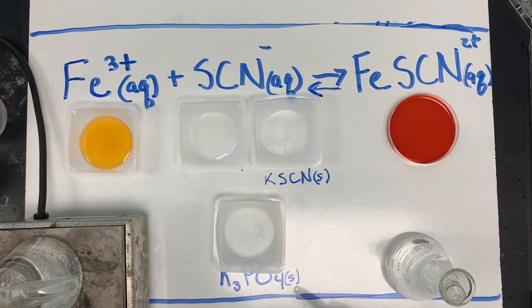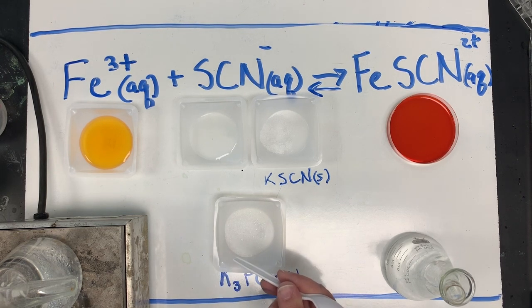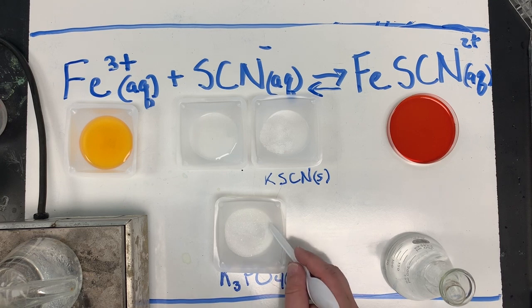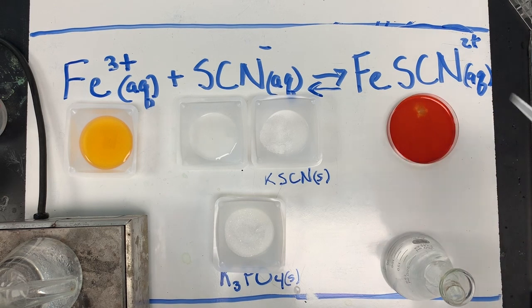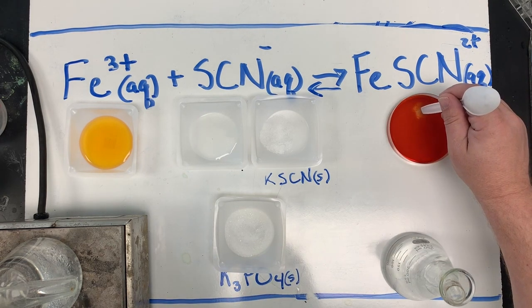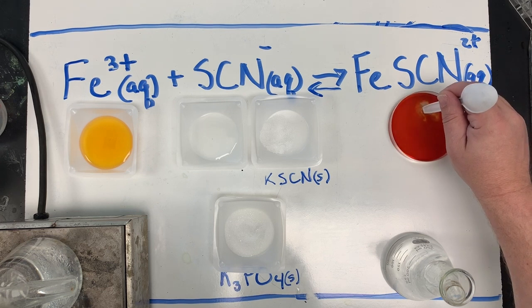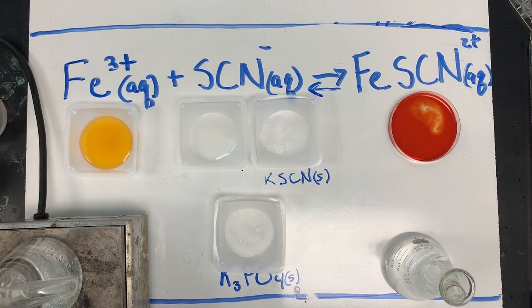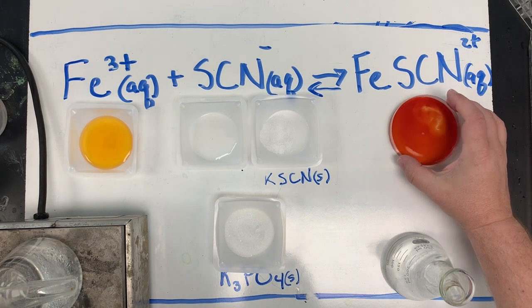So I want you to kind of think about what happens when you see me add this crystal and try to identify what happened. What drove the reaction? So I'm going to take a little scoop of this guy. I'm going to go ahead and swirl that.